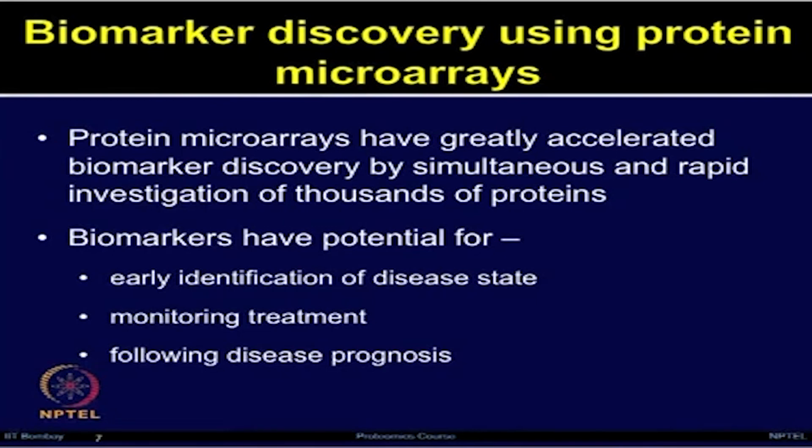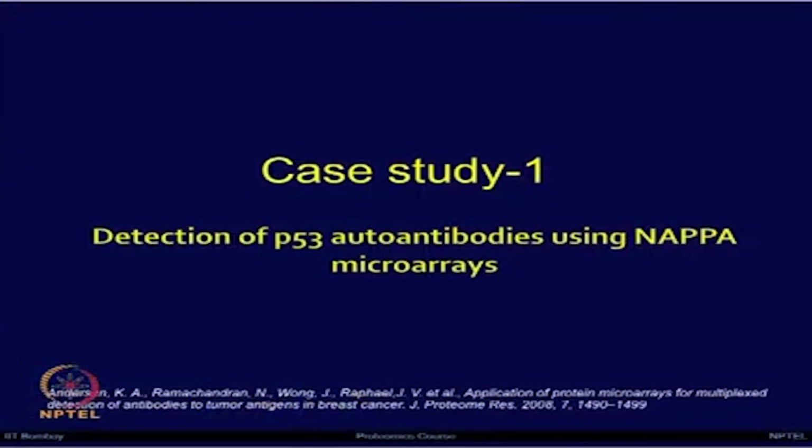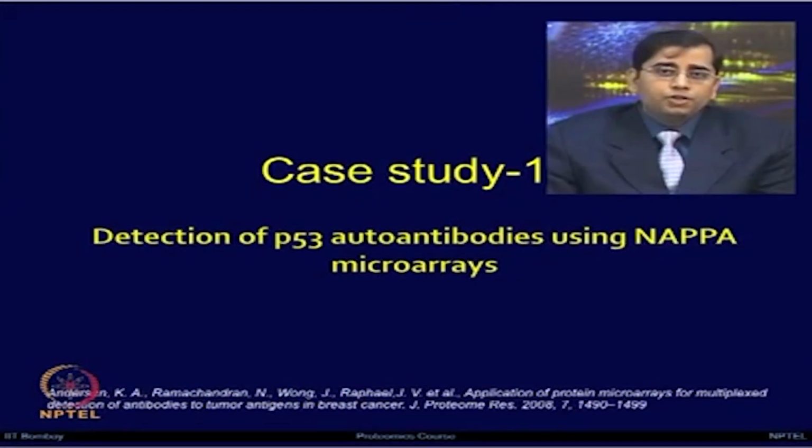So, biomarkers have potential for early identification of disease state, monitoring disease treatment response as well as follow up on the disease prognosis. Let us look at how cell-free expression based protein microarrays have been employed for screening for biomarkers. I am giving you case study 1, detection of p53 autoantibodies using nucleic acid programmable protein arrays.